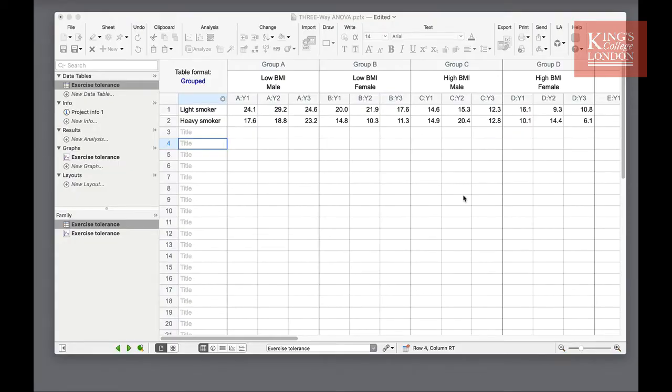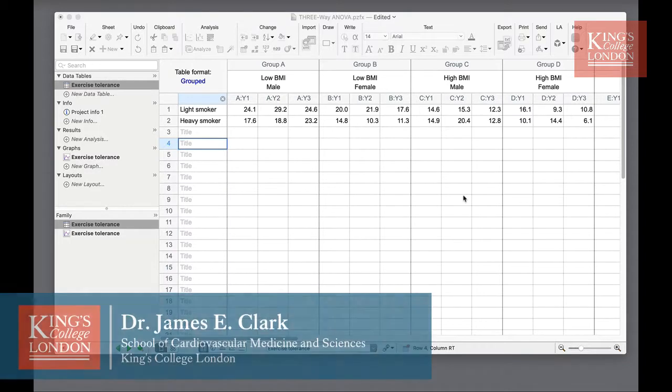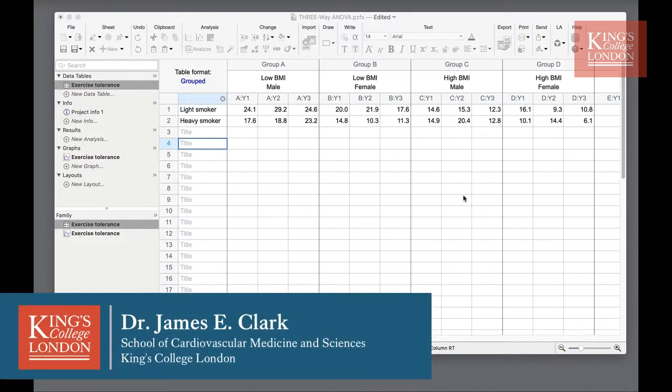Hello, I'm James Clarke from King's College London and in this short video I'm going to show you how to carry out a three-way ANOVA in GraphPad Prism.